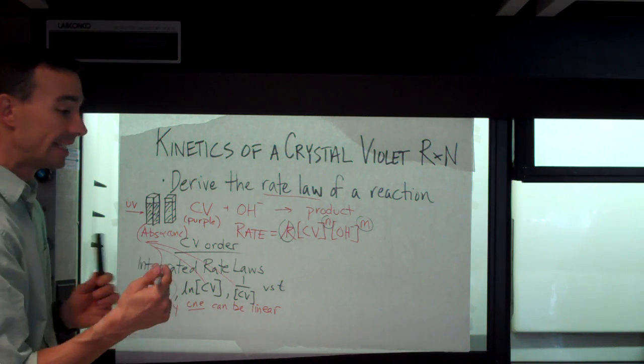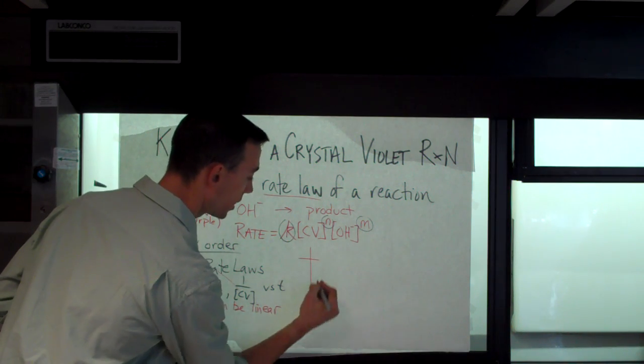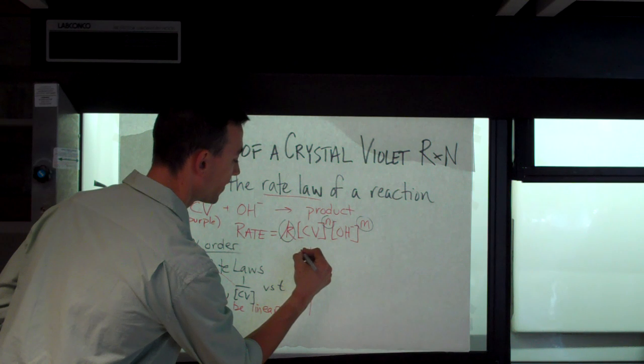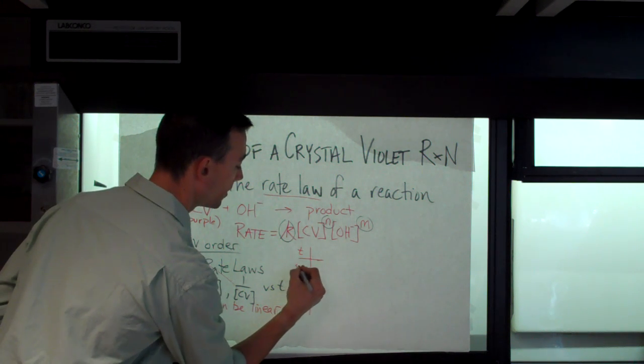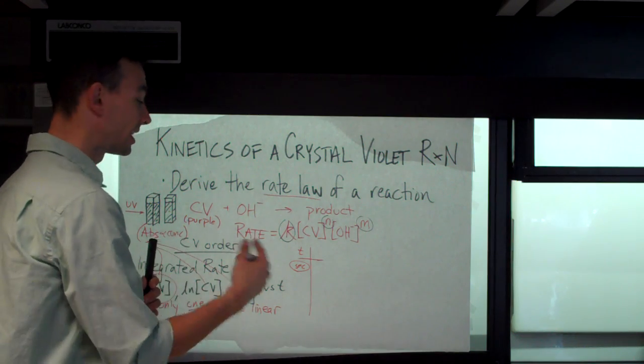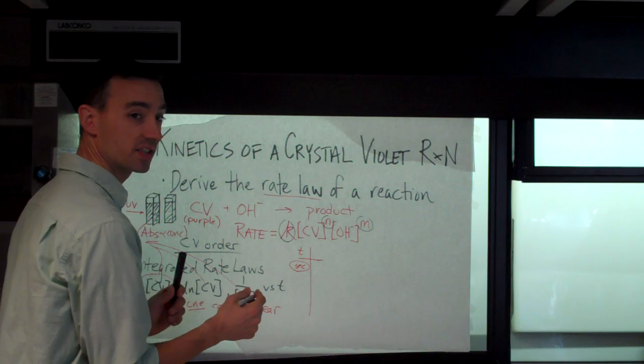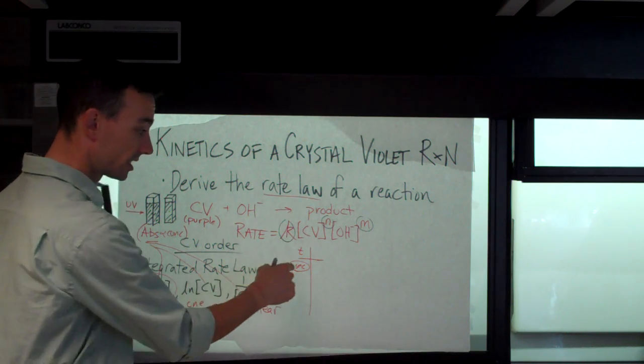So your data for the lab today is going to be quite simple. You're going to have 2 columns of data. You're going to have the time, which you should measure in seconds. Although if you measure it in minutes and then later on convert it to seconds, that's acceptable. But your graphs that you'll make will definitely need to be in seconds.